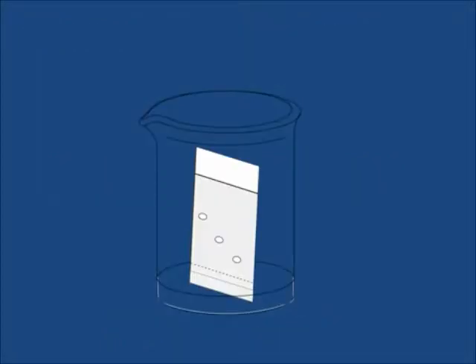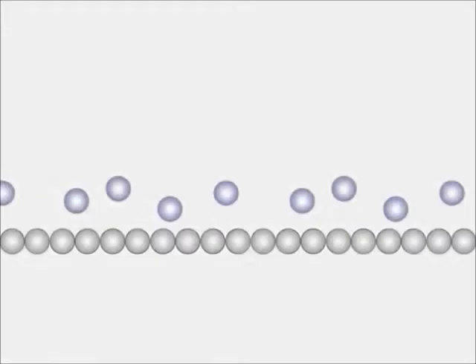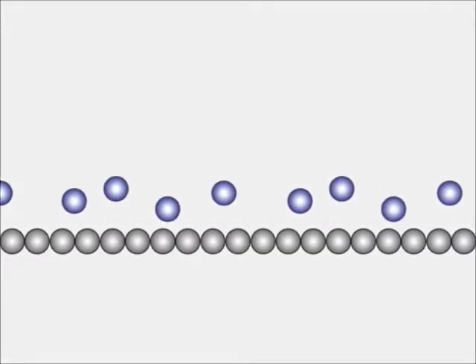So let's begin, as we normally do, by looking at the system we'll be using, but zooming in so that we're looking at it from a molecular perspective. If we zoom all the way in to the base of the plate at the molecular level, what we'll see is a stationary array of silica beads over which is flowing a moving array of solvent molecules.